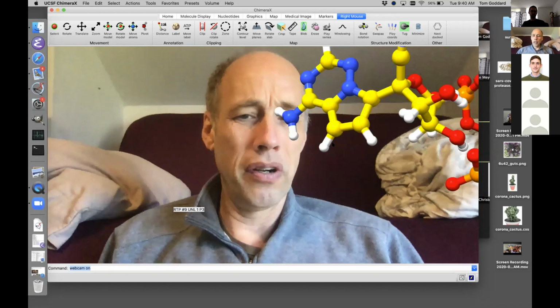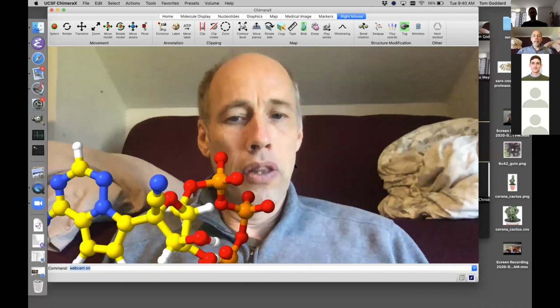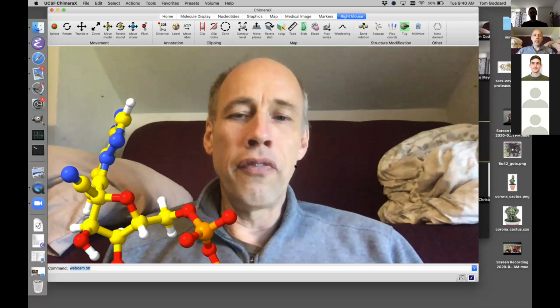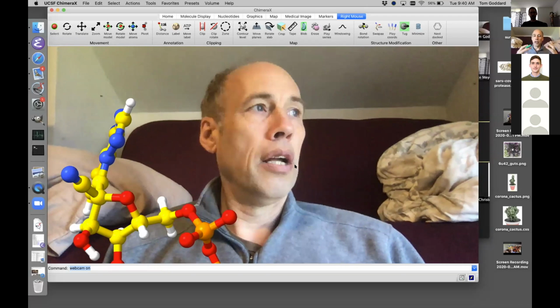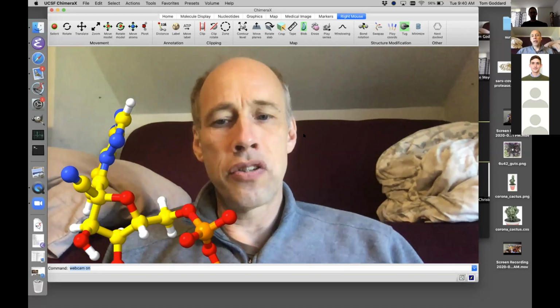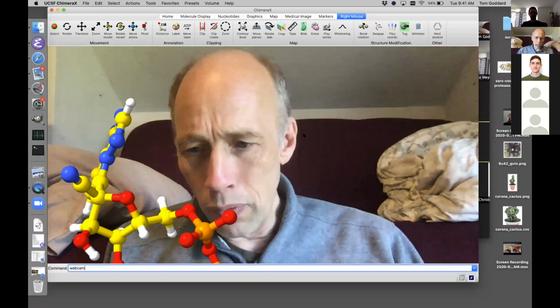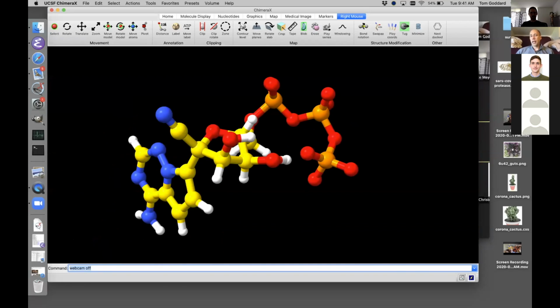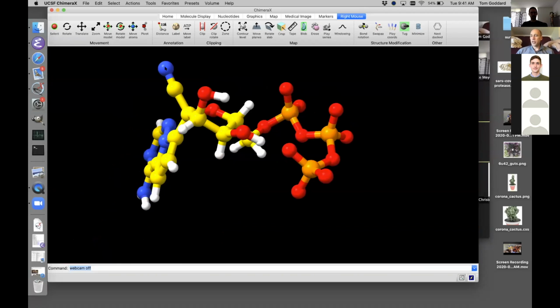Let me explain one of the key advantages, I think, of the augmented reality, and it's a subtle thing. It's hard to appreciate, hard to explain in words, but it's when you're telling somebody a story. I mean, why do I need this video at all? Why don't I just turn off my webcam and give the same presentation without me in it, and say, here's my remdesivir triphosphate, and this carbon and this nitrogen are important.